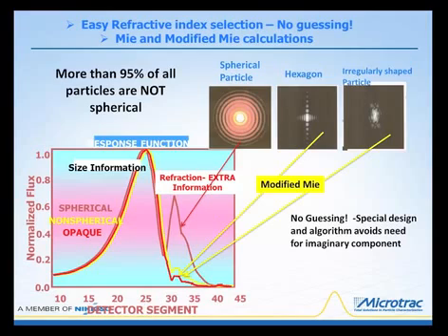For pure spherical particles like glass beads or a crystal ball, you would find this type of phenomenon occurring. These strong resonance areas particularly occur below about 20, 30, 40 microns, somewhere in that region. Once you get up to the larger sizes, these are reduced tremendously.